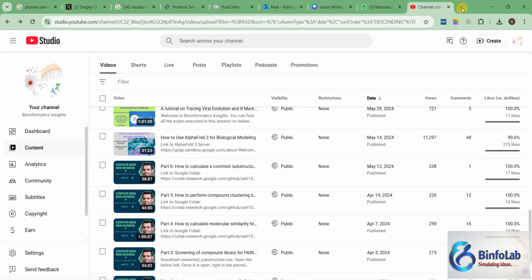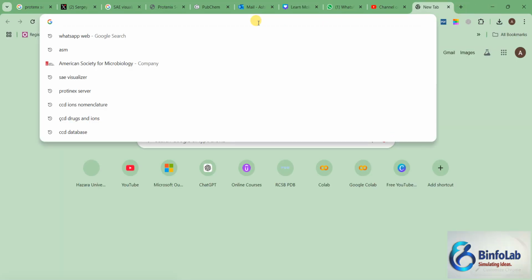so this is my previous video, how to use AlphaFold 3 for biological modeling, and it is one of the most viewed videos from this channel. So today we are going to learn one step ahead. Okay, as I told you, this is a kind of new update. It came just a week ago or less than a week ago, so far they don't have a separate web server.